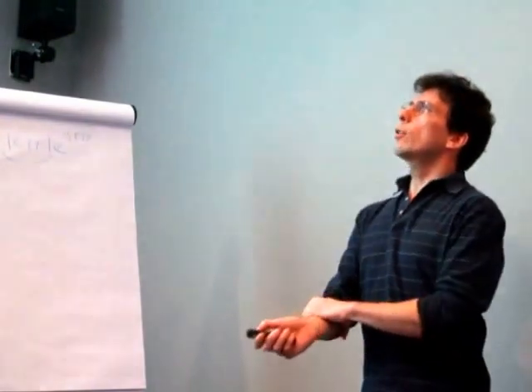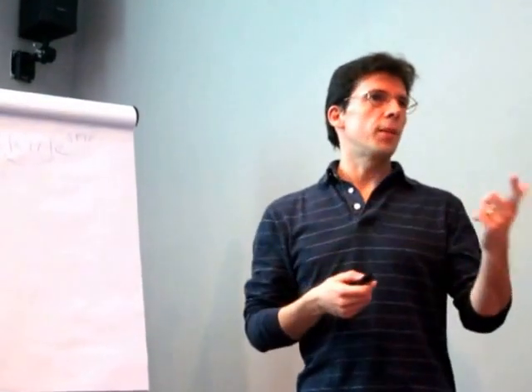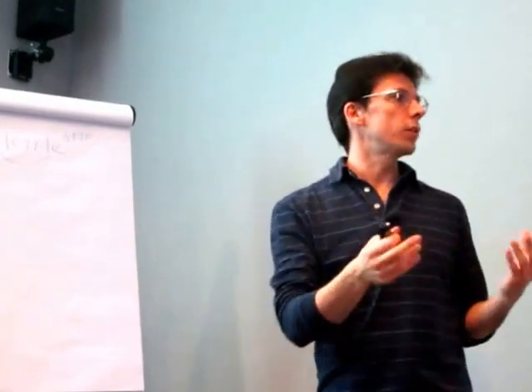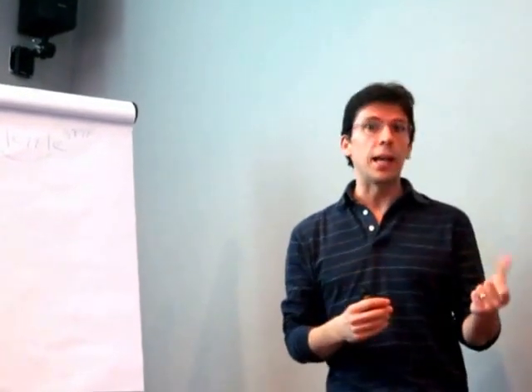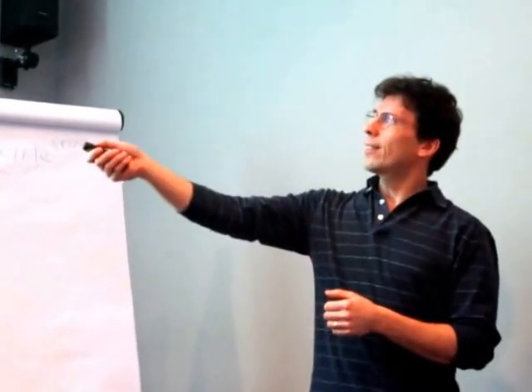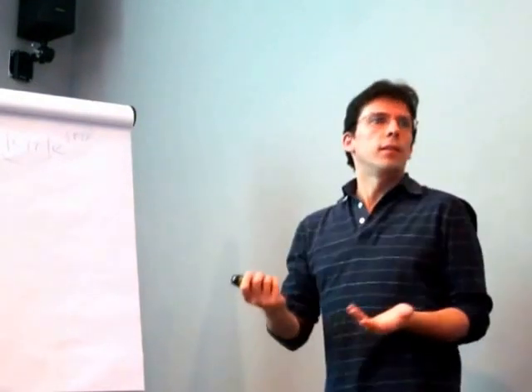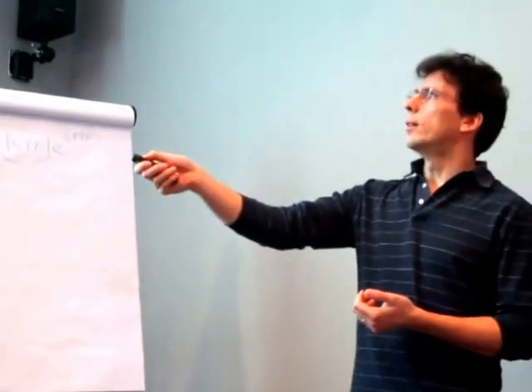So there are a number of algorithms solving both problems at the same time. This is a little bit the same as ML2D and CL2D. CL2D and ML2D are also solving the alignment and classification problem at the same time. And in fact, the extension of ML2D into 3D is this ML3D, and this here.